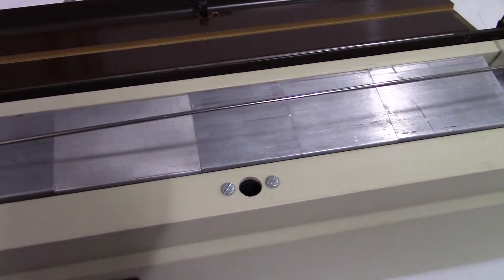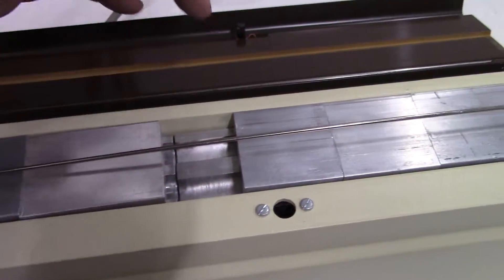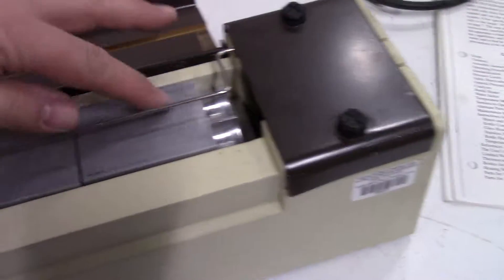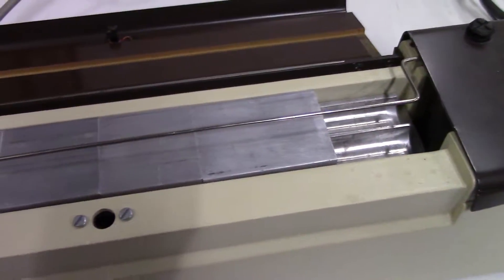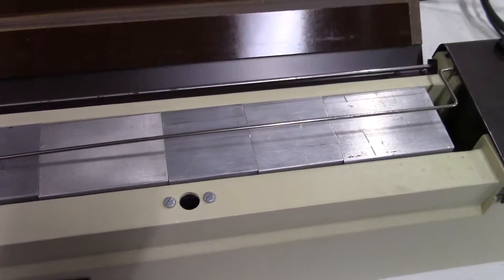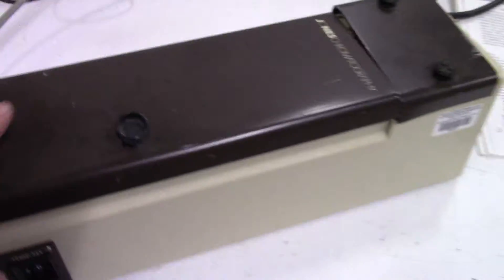This is what comes with the unit. It's got some blocks — those little blocks that come with the unit close it.